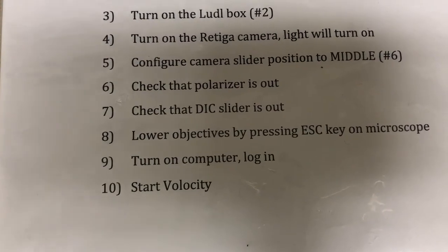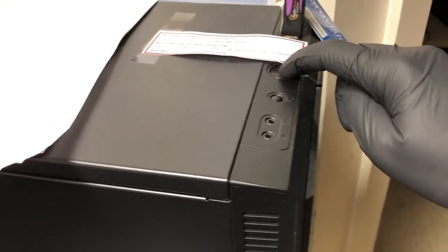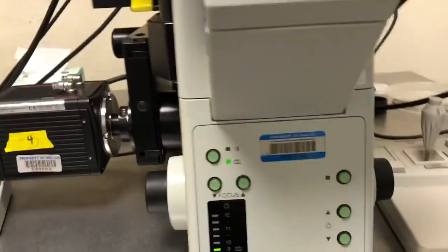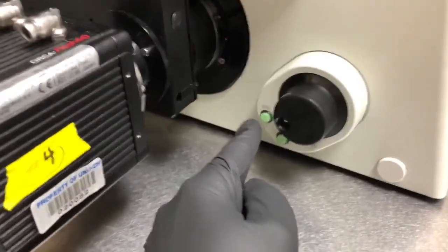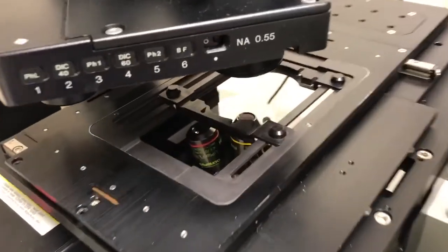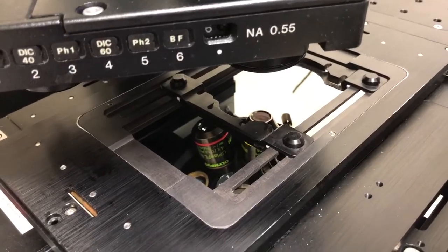Turn on the computer, log in, and then start Velocity. While the computer is starting up, let me show you a few things on the microscope. The escape key allows you to lower the objective, so it's a good idea to have it in the low position before beginning.